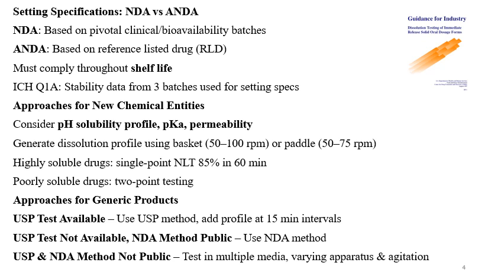Also, stability data is required to be considered. Then it must comply throughout the shelf life. ICH Q1A provides you the information regarding stability data from 3 batches used for setting the specifications. Then approaches for new chemical entities.